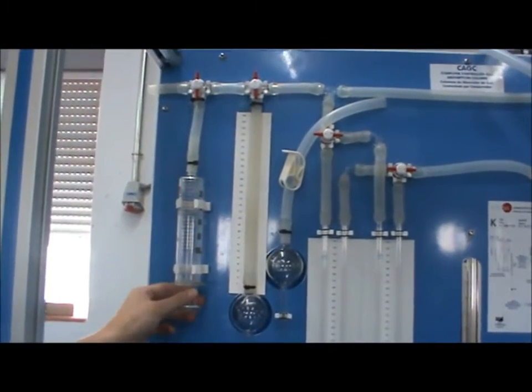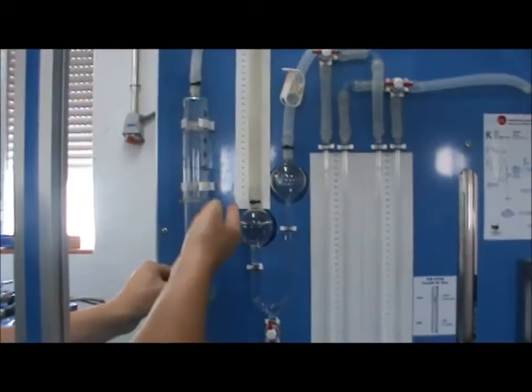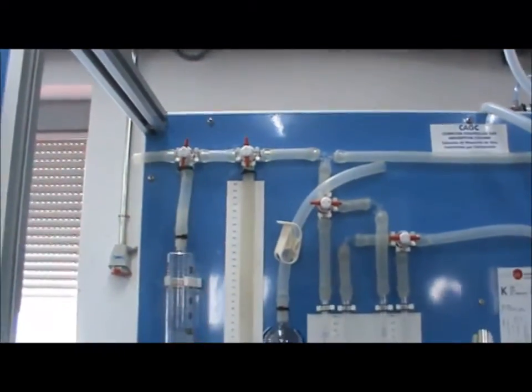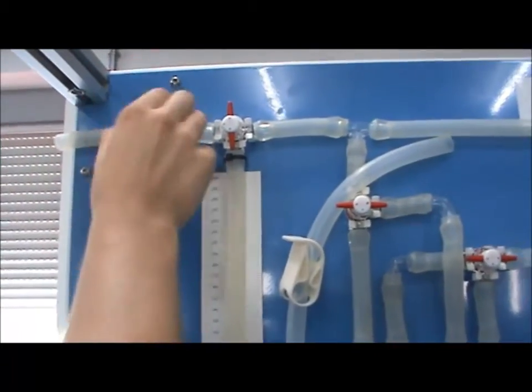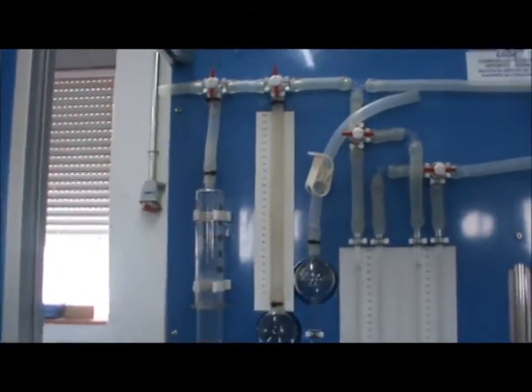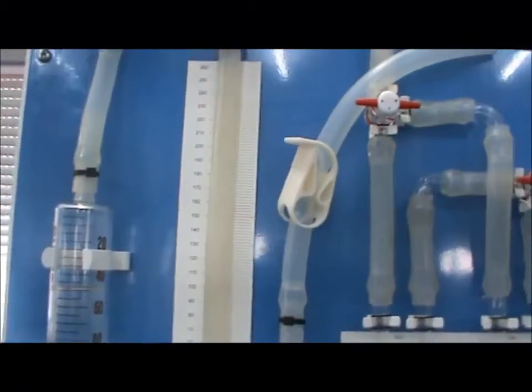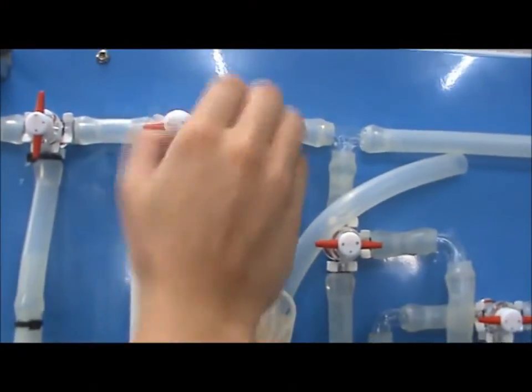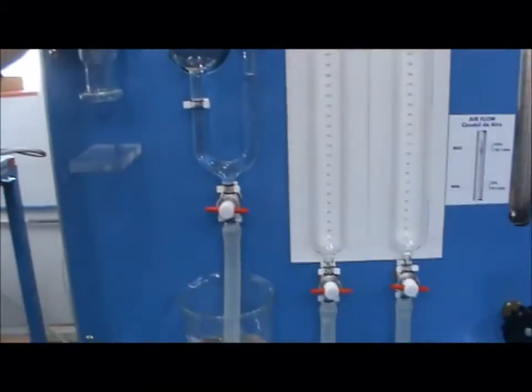Make sure valve V1 is open and push the plunger downwards, sucking the KOH solution up through the U-shaped vessels. Repeat by first closing VT3 and expelling the air to the atmosphere. Make sure the solution rises to a level somewhere within the measured range below valve VT2. To keep this level fixed, close both VT2 and V1, isolating this portion of the line.